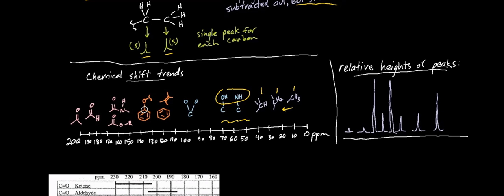So alcohols and amines. A carbon with 2 oxygens very characteristically is, and as we would expect, much more deshielded, around 100. Aromatics and alkenes are in the aromatic region, about 110 to 140. An oxygenated aromatic carbon is often very deshielded, more like around 150, 160. Because when you think about it, it's almost like a carbonyl, right? A double bonded carbon with an oxygen on it.